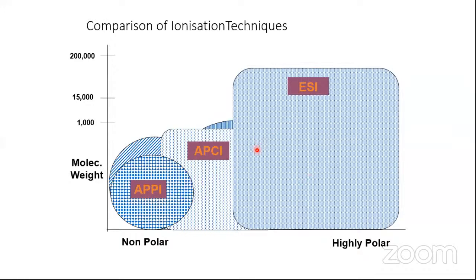And that is how we have a true solution available for LCMS, which gives us sensitivity up to picogram or femtogram level. Okay, so never possible by LC alone. And that is why these techniques have become so popular that today LCMS is there in every pharma industry, in many research labs, and even in Mumbai University, we have, I think, LCs.